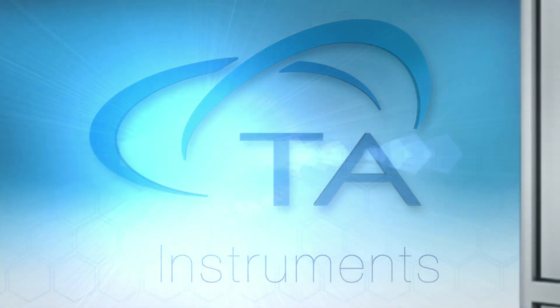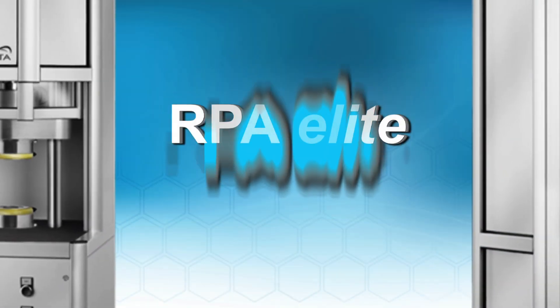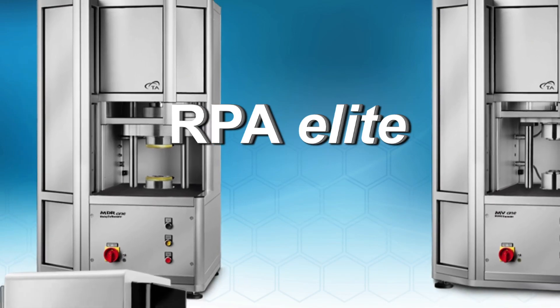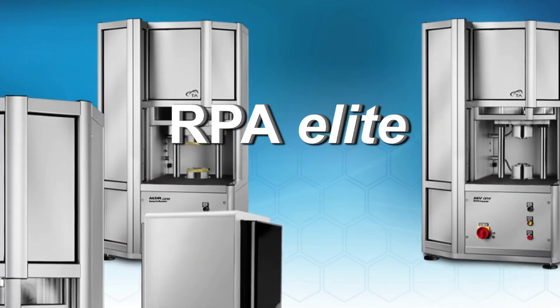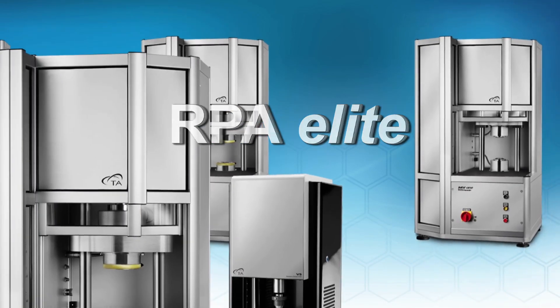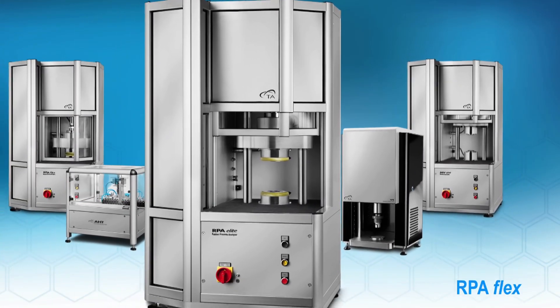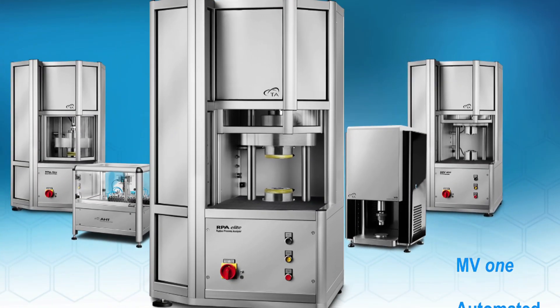TA Instruments is proud to introduce the RPA Elite, the most advanced rubber rheometer in the world. The RPA Elite is part of the new line of rubber testing products including the RPA Flex, MDR1, MV1, and the automated hardness and density testers.